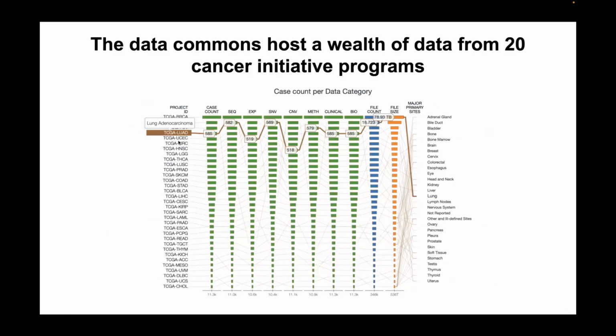So what we do is we have our own extract, transform, and load pipeline, ETL for short, where we take the data from GDC. We do all those steps that I was just talking about. We download all of these individual files. We generally work on a program by program basis. We load them into the cloud. Then we convert and standardize the file formats. We QC a little bit, but generally a lot of that is already done by GDC.